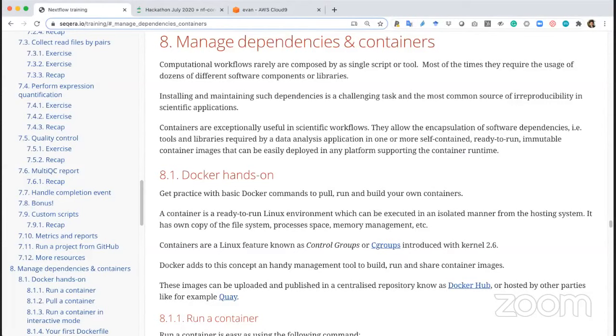One of the interesting things was that you could take that idea and apply it to bioinformatics tools or any kind of batch-like computation. Early on, a lot of the tooling around containers was done with Docker, and there's some excellent tooling around that. Docker has almost become a de facto standard for containers.